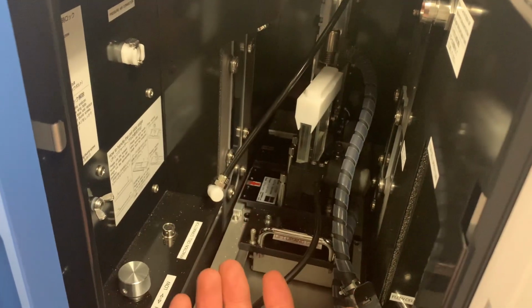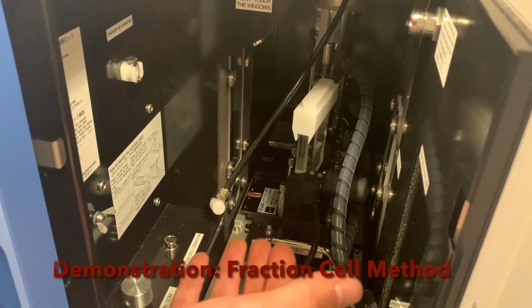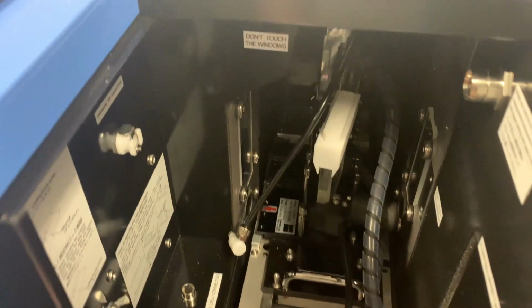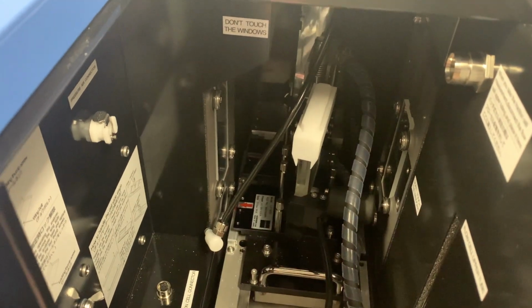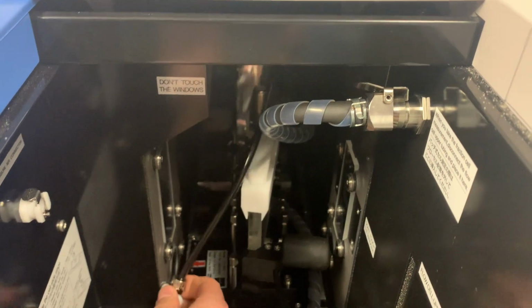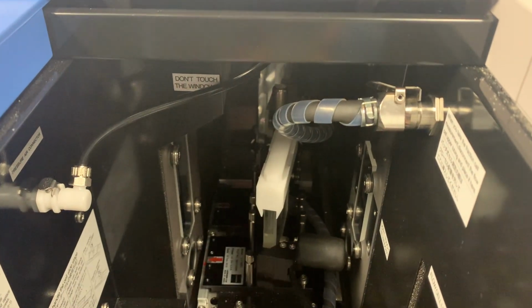The method that I'm going to be demonstrating today is the fraction cell method. Once the cassette is inside of the instrument and aligned with the red arrow, you're going to want to make sure that the other connections for the other cells are out of the way so that the path of the laser remains free. That means moving aside some of the hoses and wires that might be associated with some of the other methods of collection.